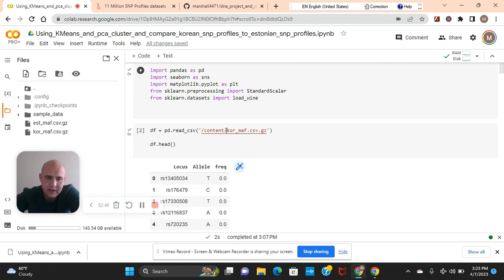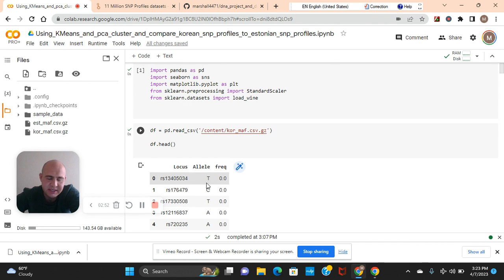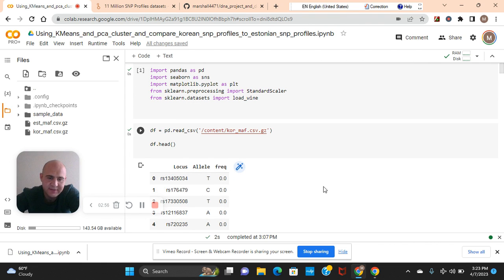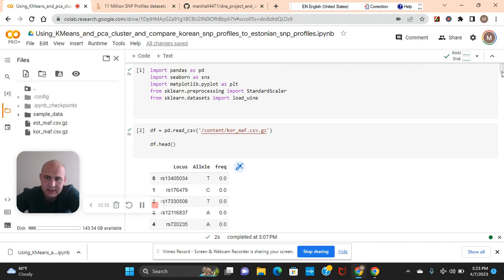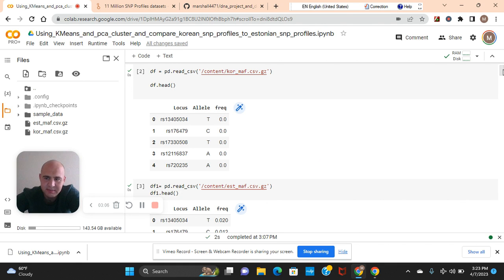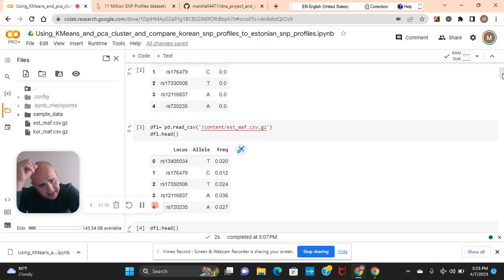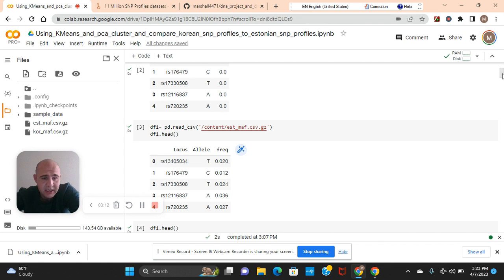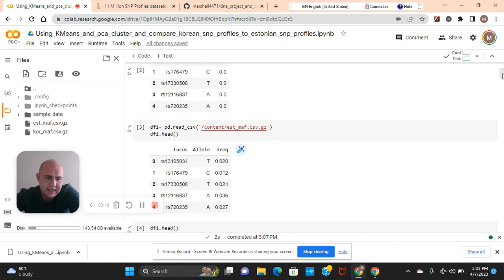Anyways guys, let's get started. Import these libraries, read the first data frame, look at the head. As you can see, we're going to need to encode this. And then there's the frequency. There's not much frequency in the first five rows. The frequency, the alleles and the locus, and then there's the frequency. Remember, these are SNP clusters.